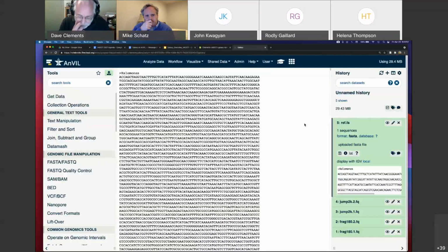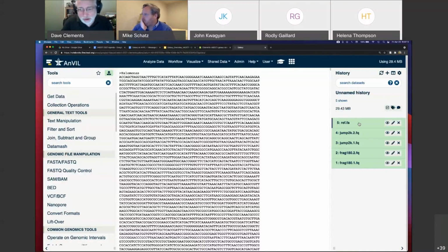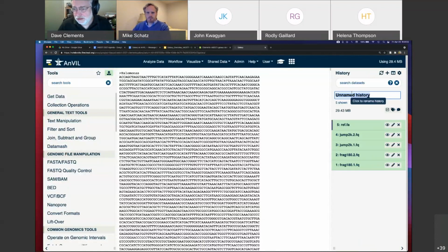So if we have to do this 3 or 4 times to get it right, and we come back an hour from now and we have 4 unnamed histories, we're not going to know which one worked. Okay? So always name your histories. That's the first thing, best practice.